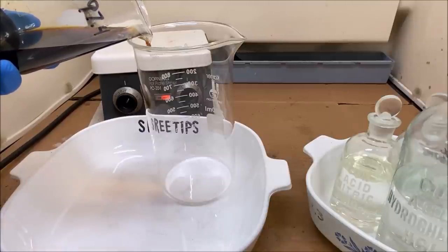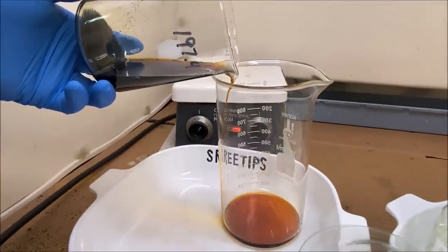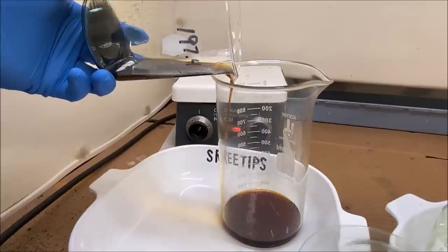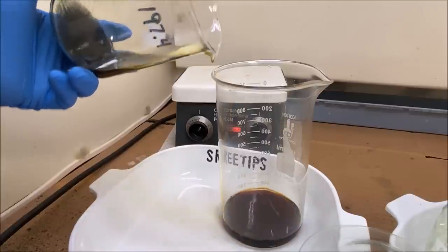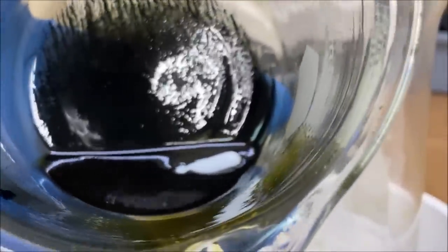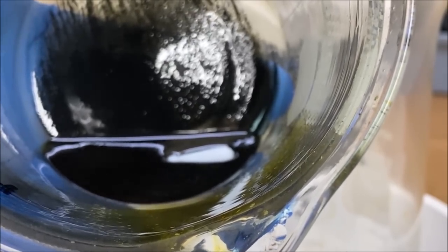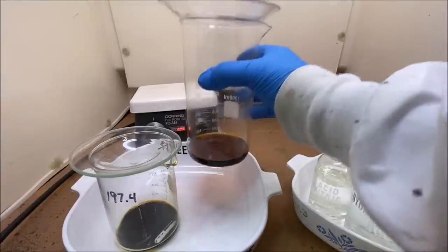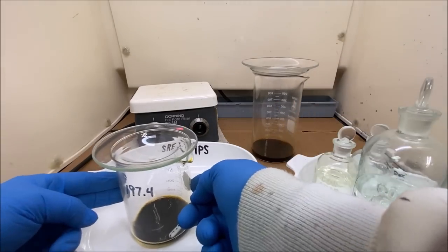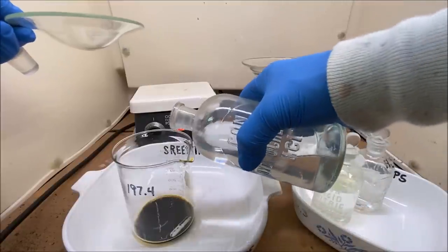Pour this off and see what kind of solids we got left in here. Here's our solids that we have left in our beaker. I hope I didn't ruin it by getting it too hot. What I'm going to do is set this back out of the way. This is our solution that we've created by dissolving the powder here in aqua regia. There's some black solids down in the bottom of this beaker.